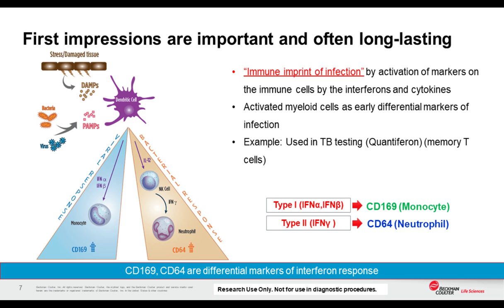However, direct measurement of interferons is a challenge. The short-lived nature of interferons makes direct measurements difficult. However, interferon signaling pathways can be observed by the downstream genes and the markers activated by these molecules, sort of an immune imprint of interferon signaling.